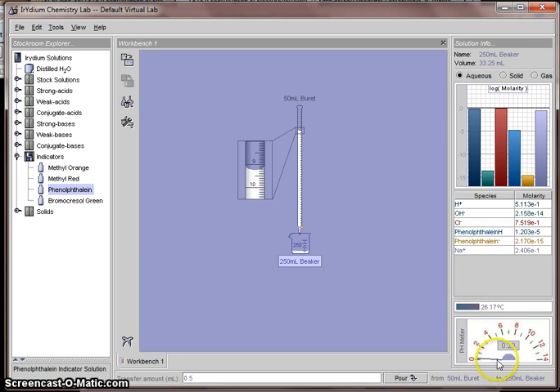Okay, I'm sorry, pH also increases. Yes, that is correct. So we keep on adding, and so now the volume is about 39, 40, and you can see the pH is going up, and so at this stage we have 49 milliliters of total solution.